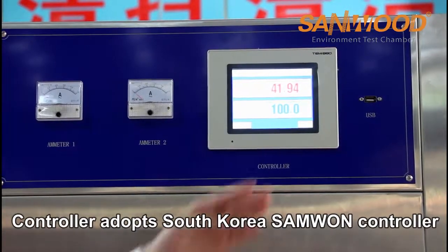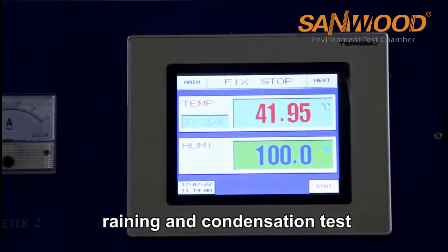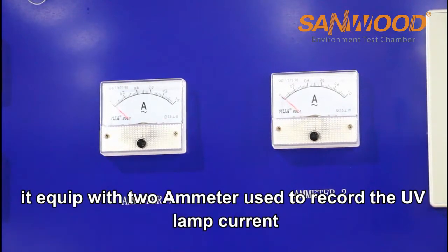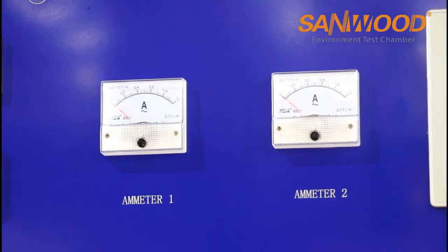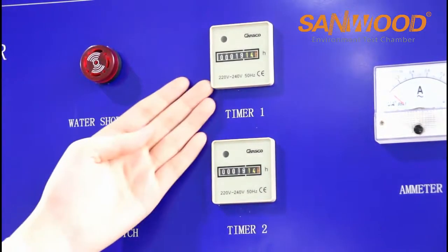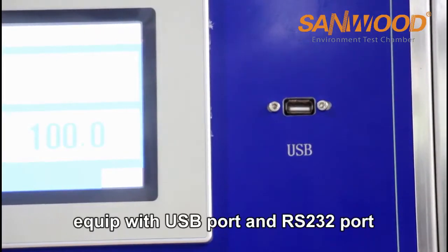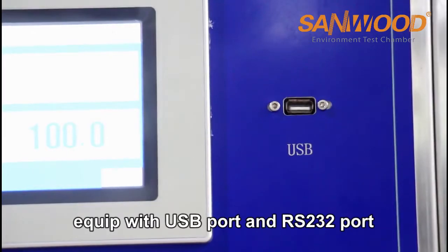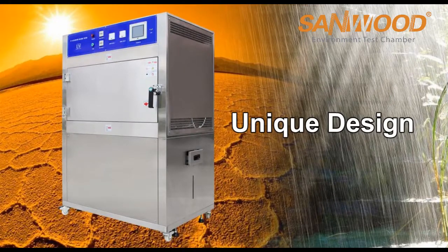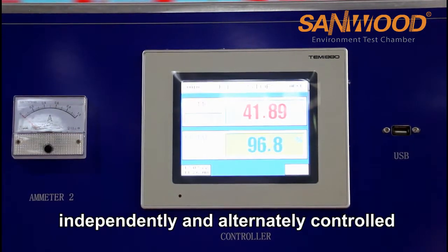The controller is the South Korea SAMWON Tech controller. It can program UV exposure, raining, and condensation tests. Equipped with 2 ammeters used to record the UV lamp current. Equipped with 2 timers: Timer 1 is used to control 4 UV lamps, and Timer 2 is used to control the other 4 UV lamps. Equipped with USB port and RS232 port to record the test data. Light and condensation can be independently and alternately controlled.